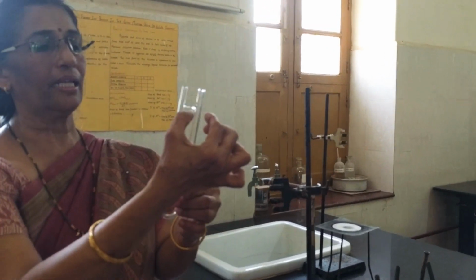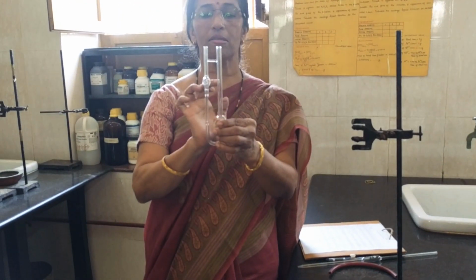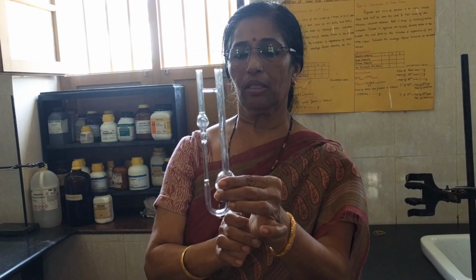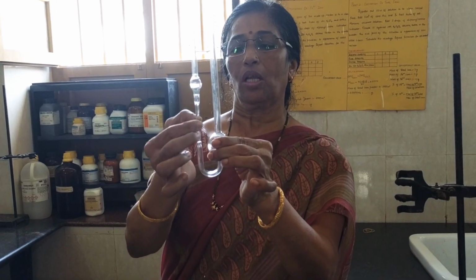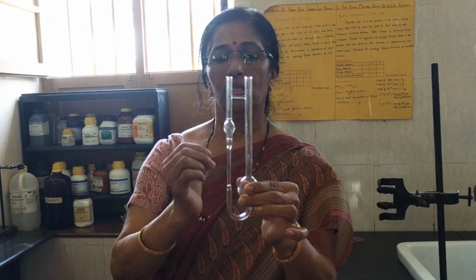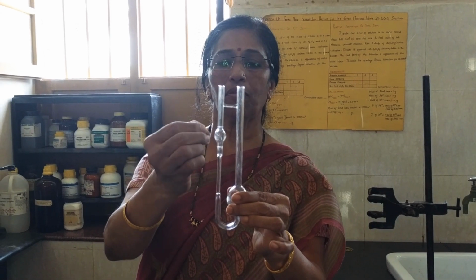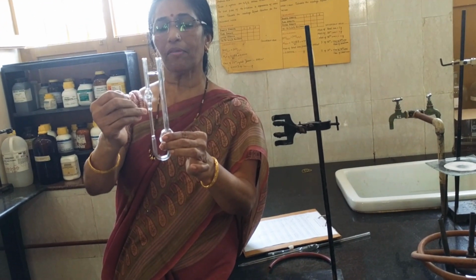You know that when I take a liquid in a big nozzle of this size, the liquid adhered to the walls will have a different flow. The liquid in the middle will have a different flow. Hence, in this Ostwald's viscometer, there is a fine capillary through which the liquid flows. So I make the liquid flow through the fine capillary and determine the time of flow. The greater the thickness of the liquid, that is, if it is more viscous, then it will flow slowly, and it also depends on the intermolecular forces of attraction, otherwise it will flow fast.